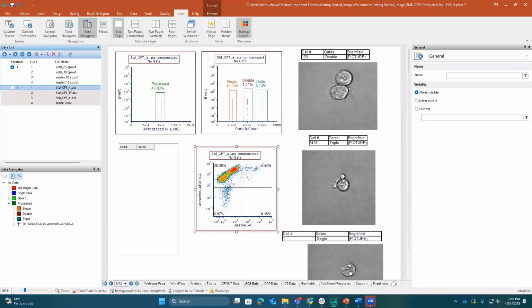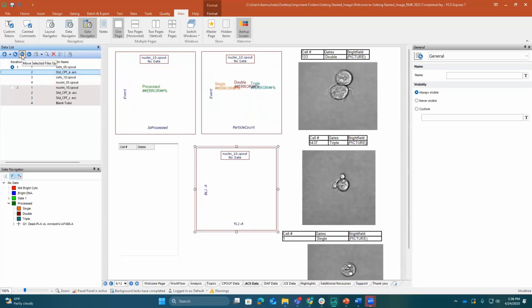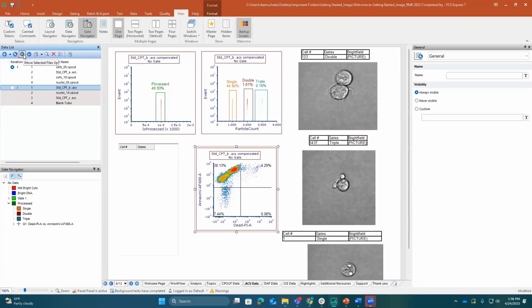If I wanted to reactivate all my iterations, what I could also do is just move this up. So now the 2 data files are being used as expected. Can adjust this so that it has the same kind of data file, because there's a little bit of disconnect because I'm using so many different tools at the same time. So if there's any confusion there, I'm happy to explain that, but this is just kind of a tool that you can use, our panels, if we're using different controls or different data set numbers.